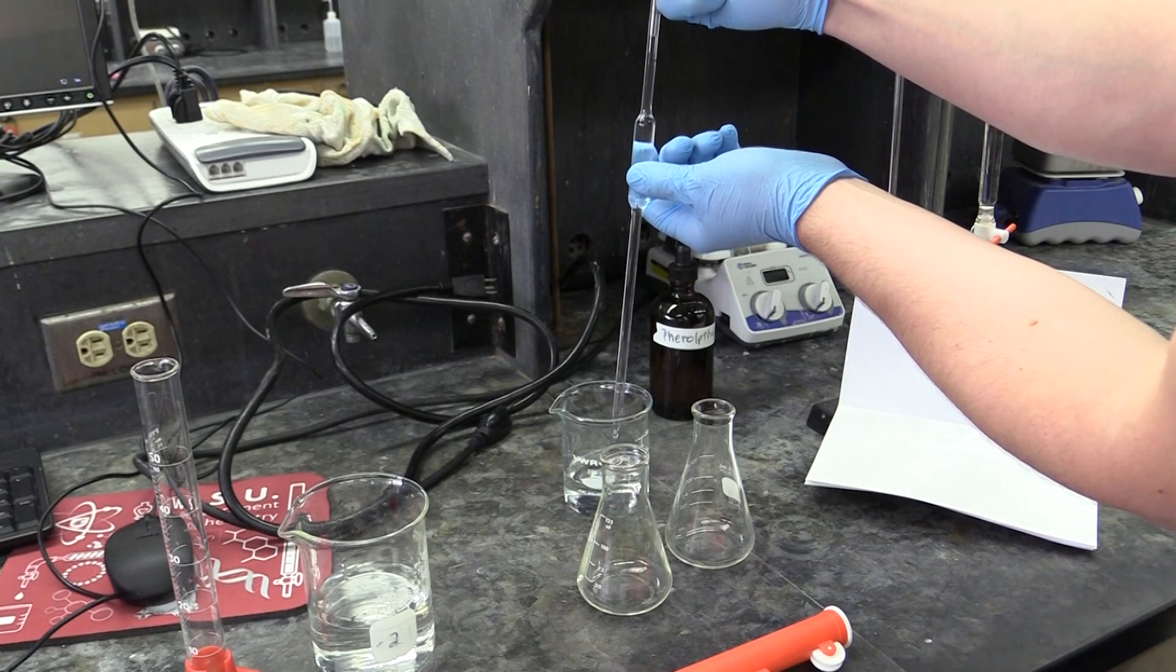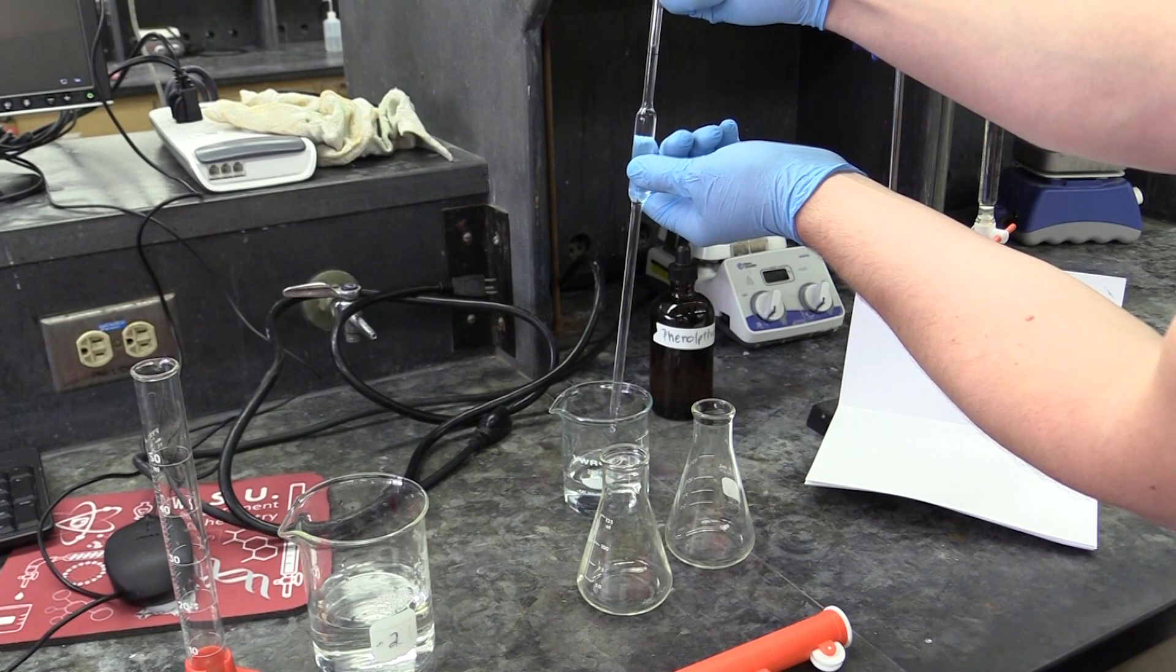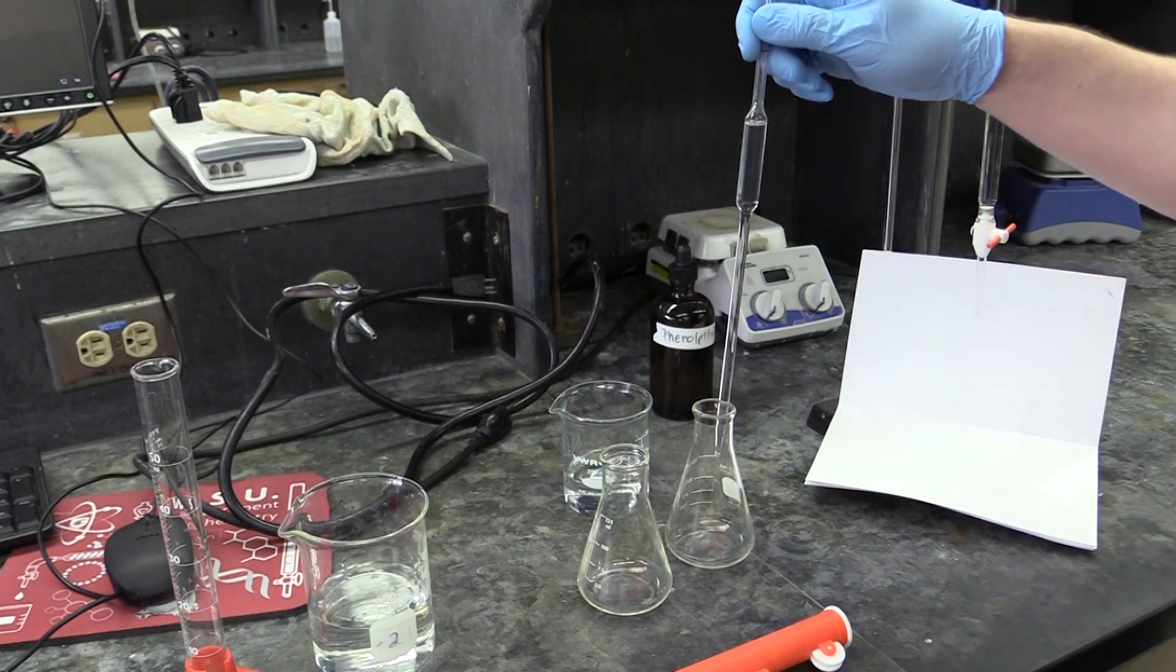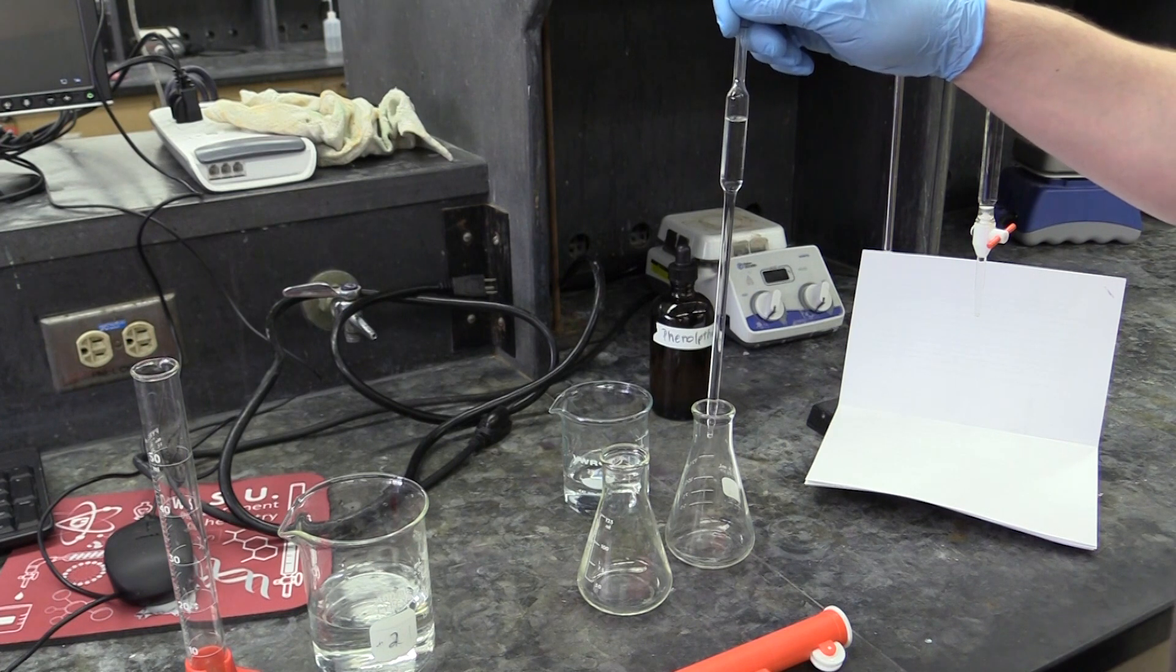Next, you will prep your Erlenmeyer flasks with some of the acid solution you just made. Do this by pipetting one aliquot, that's a fancy term for one pipette's worth, one aliquot of acid into each flask.